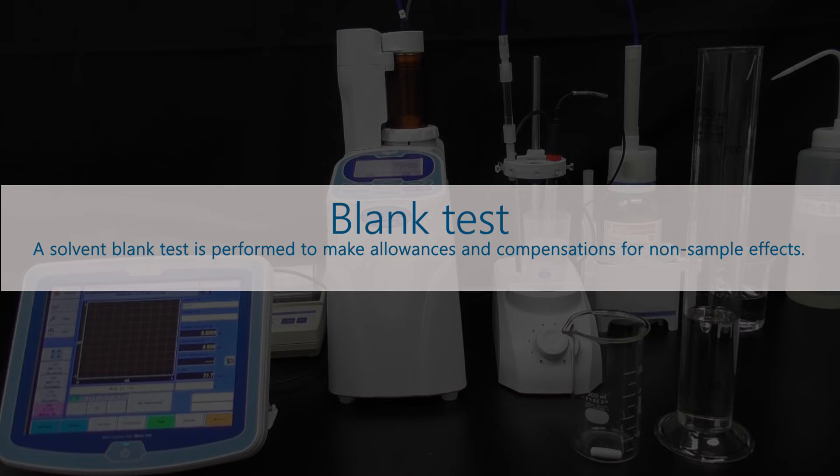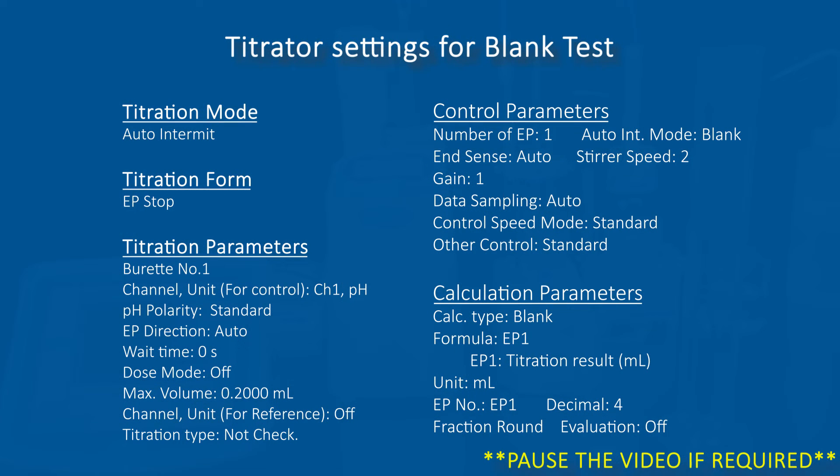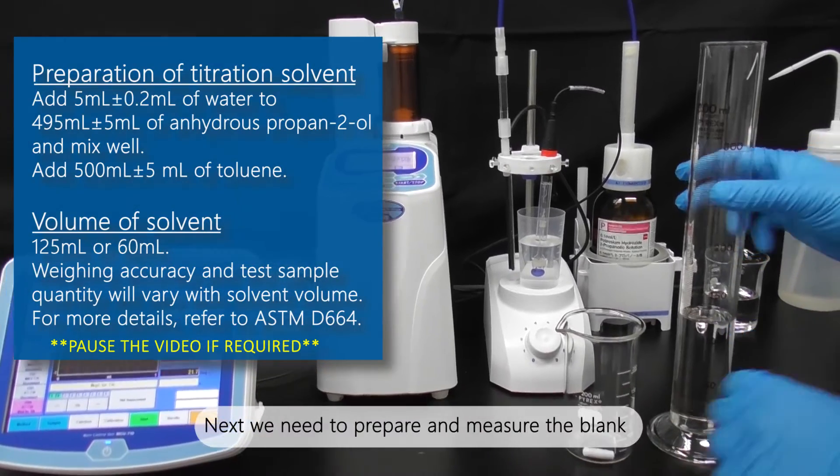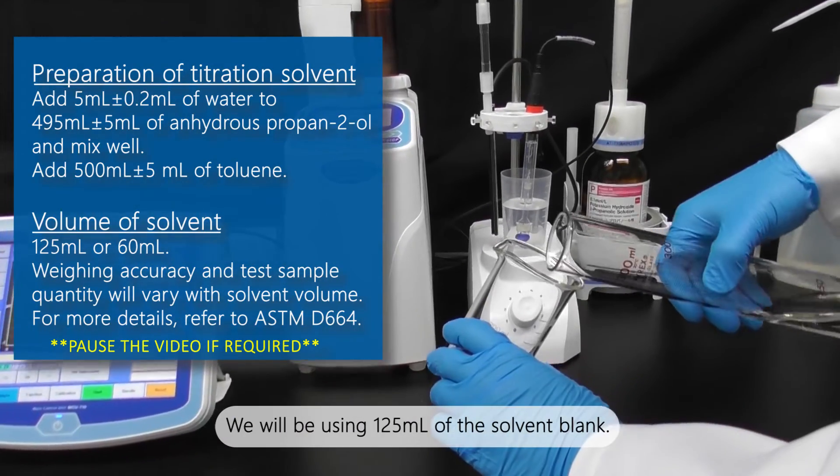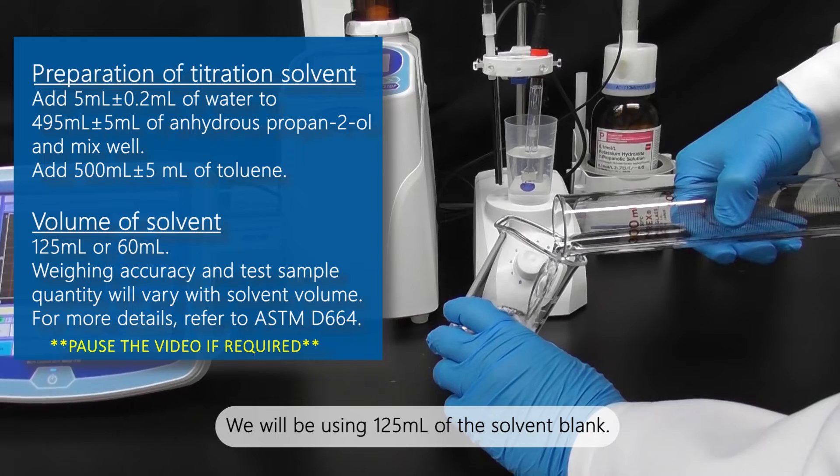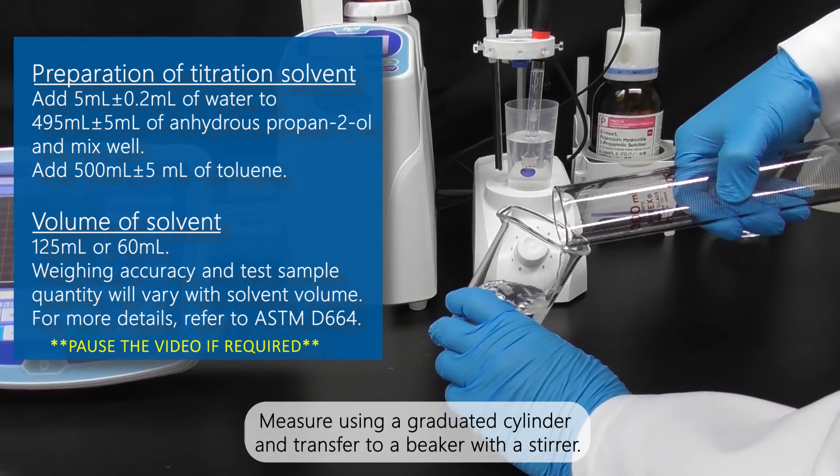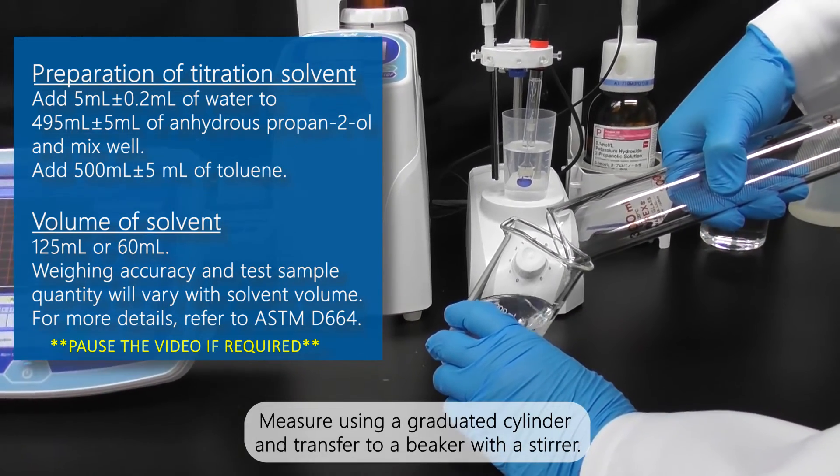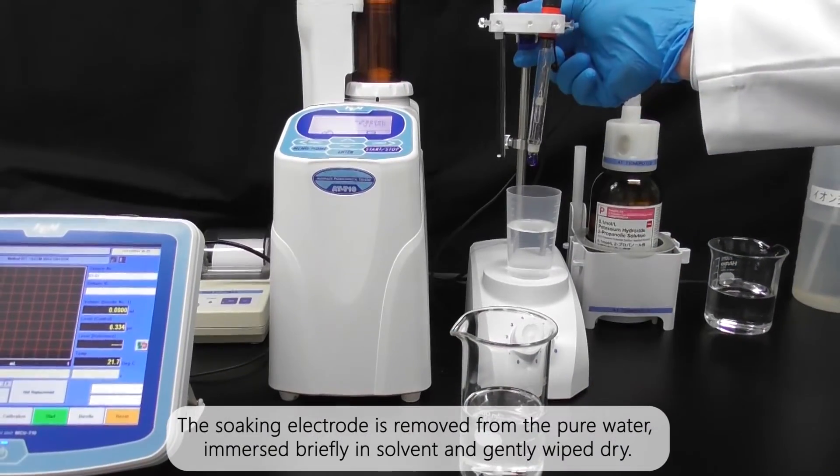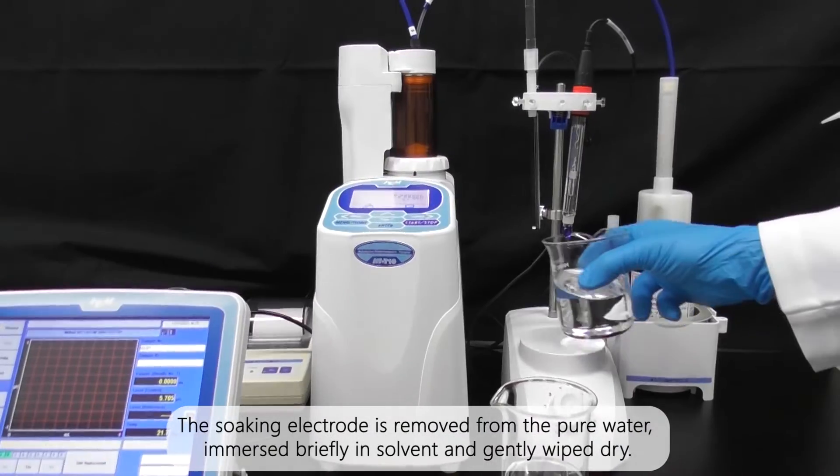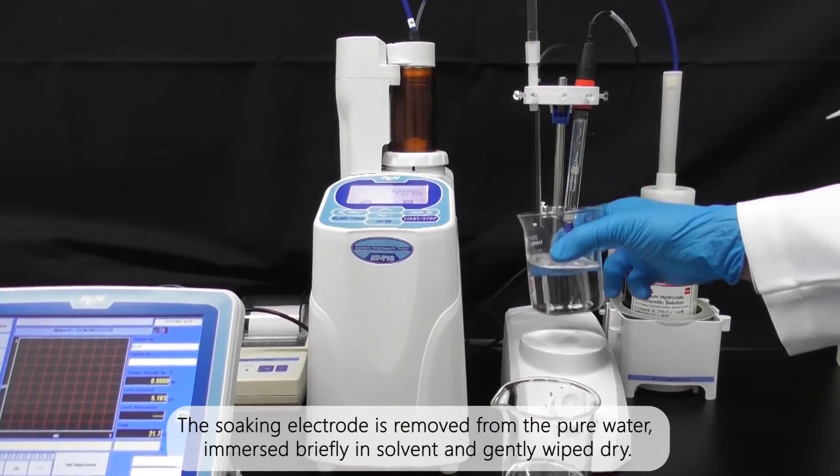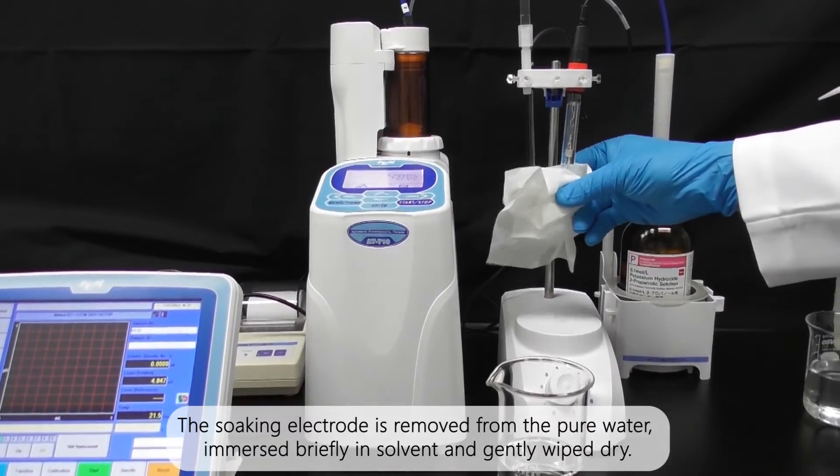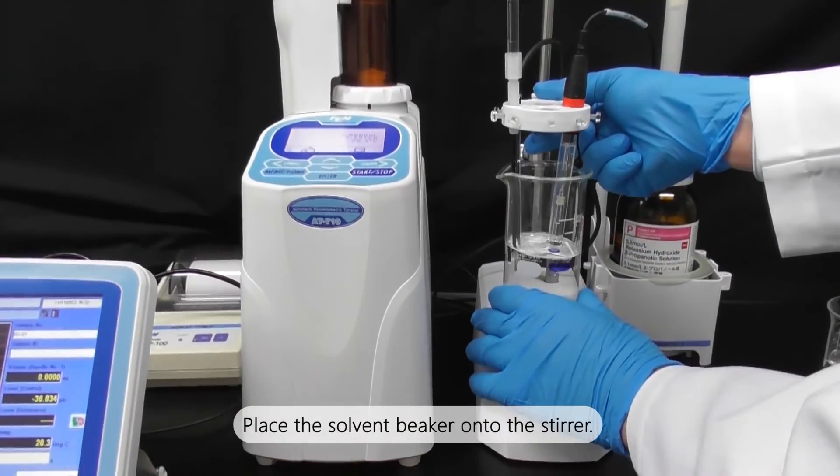Blank test: Next, we need to prepare and measure the blank. We will be using 125 mL of the solvent blank. Measure using a graduated cylinder and transfer to a beaker with a stirrer. The soaking electrode is removed from the pure water, immersed briefly in solvent and gently wiped dry. Place the solvent beaker onto the stirrer.